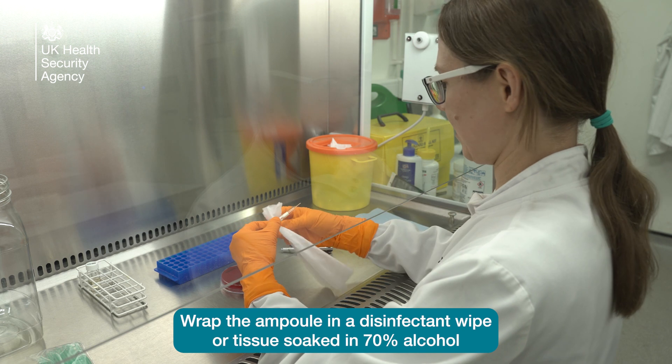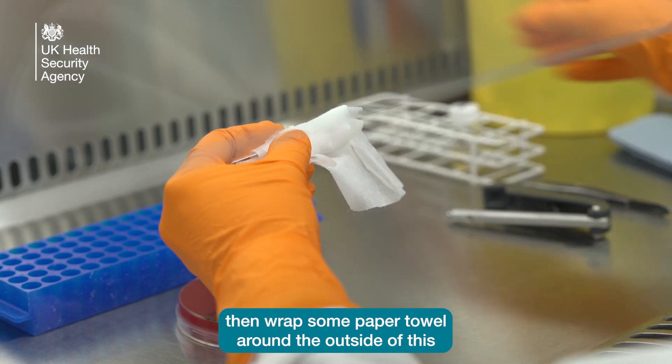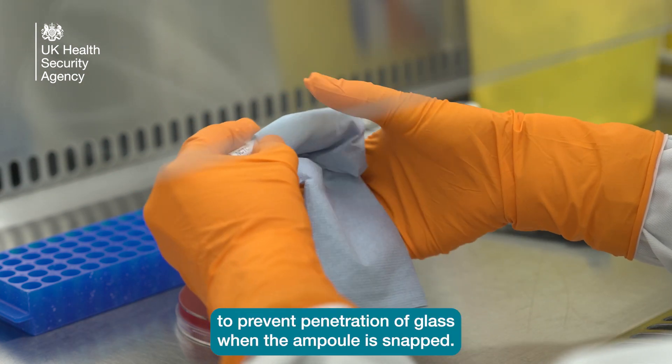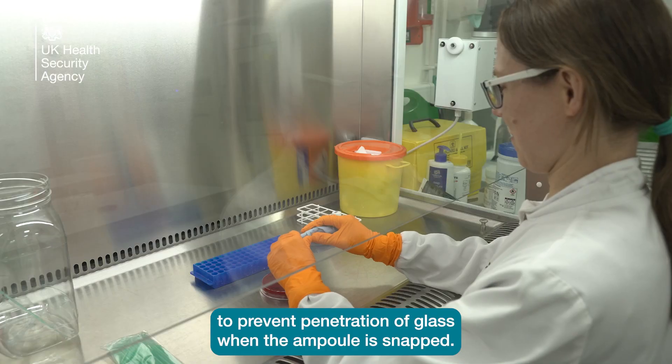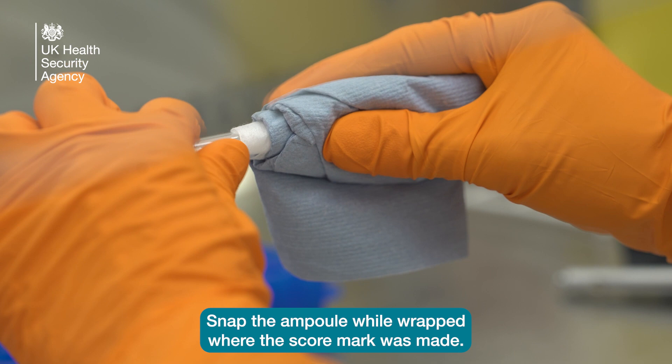Wrap the ampoule in a disinfectant wipe or tissue soaked in 70% alcohol, then wrap some paper towel around the outside of this to secure the protection layer to prevent penetration of glass when the ampoule is snapped. Snap the ampoule while wrapped where the score mark was made.